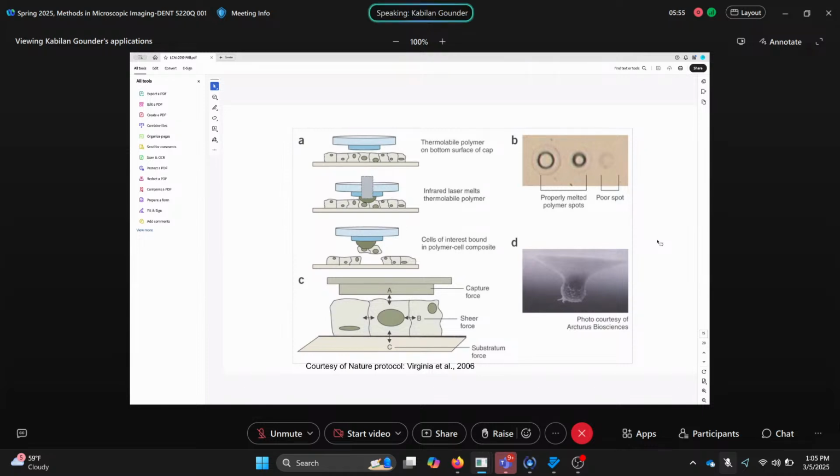So when you go for subsequent analysis, like isolating DNA, RNA, or protein, and then go for some downstream application, this helps. So that is the main advantage of this laser capture microdissection. The technique is, as discussed, very simple.